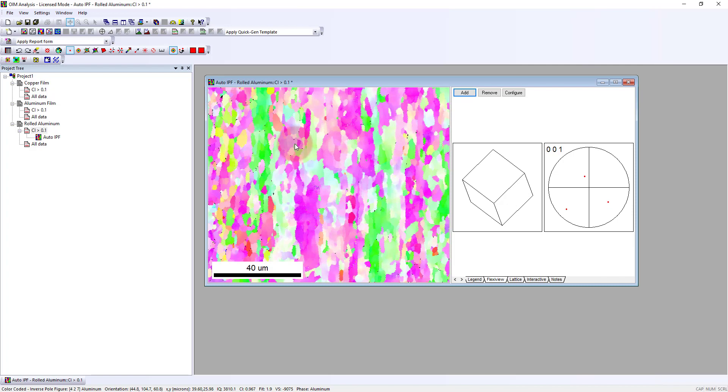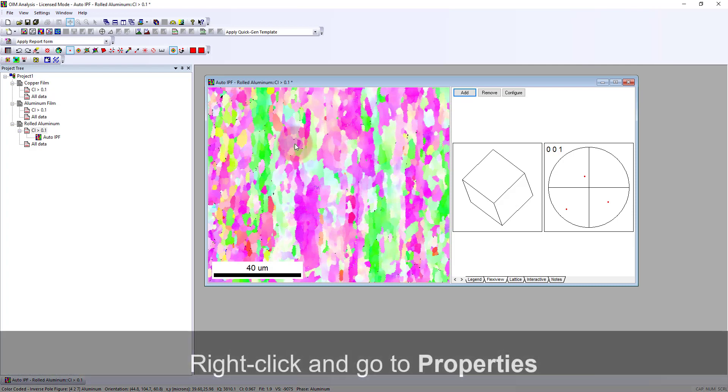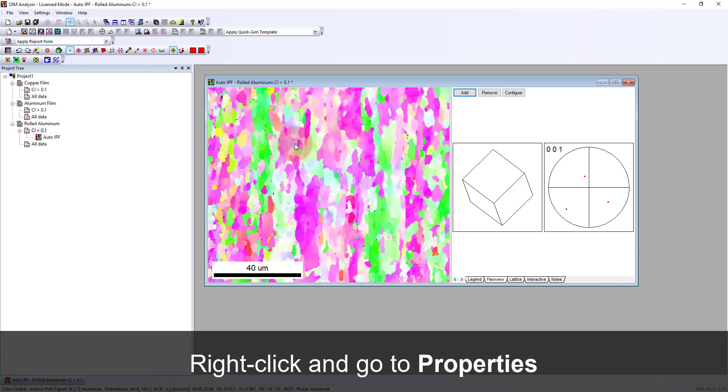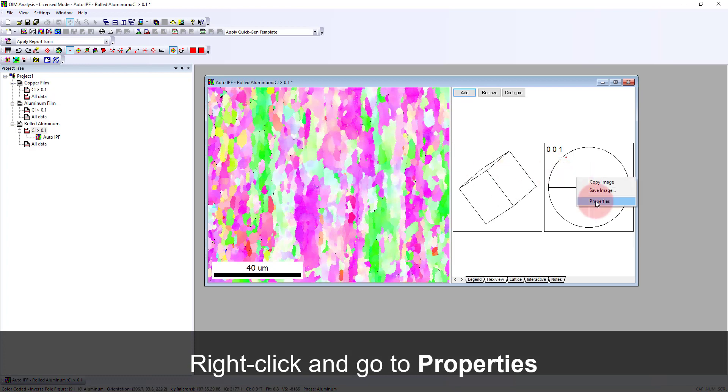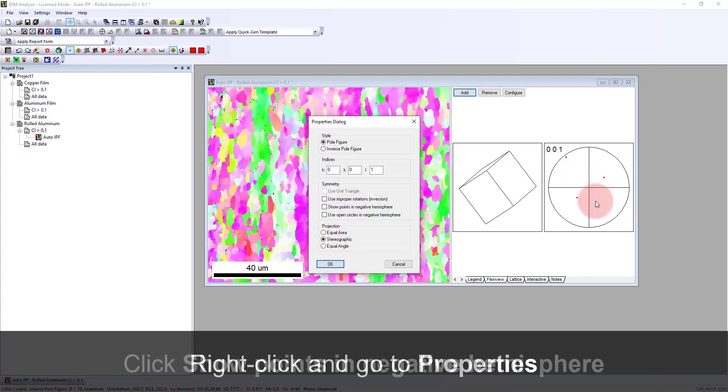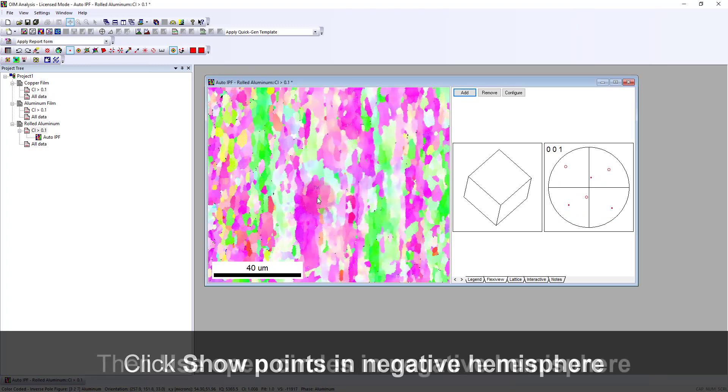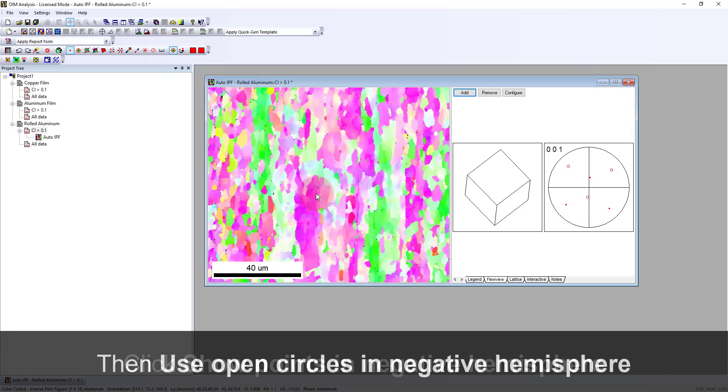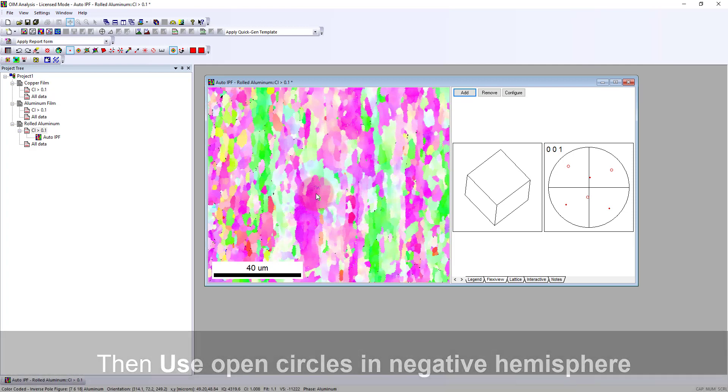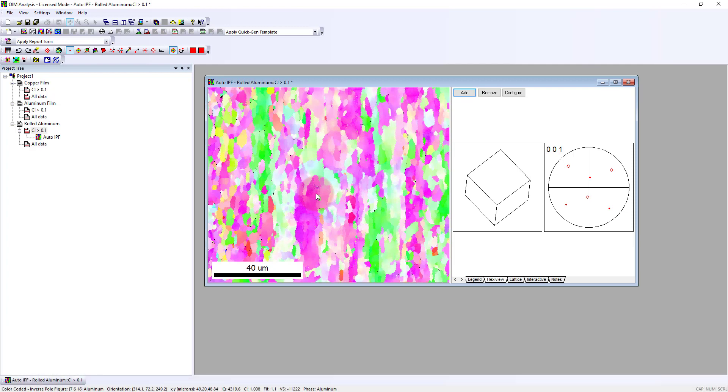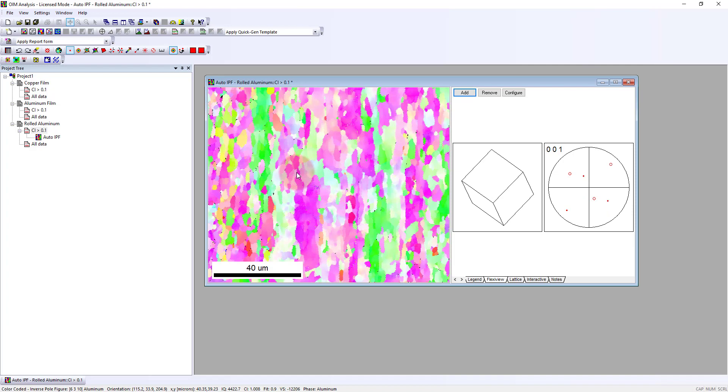The number of poles we see are dependent on the crystallographic symmetry of the crystal. Here we're looking at a cube, so we're seeing three faces of the cube from the 001 pole. There are three negative hemisphere ones available as well. If I right-click here and go to properties and say show points in the negative hemisphere using open circles, you'll see how the poles, the planes facing away from the displayed crystal, are now projected in the opposite direction.